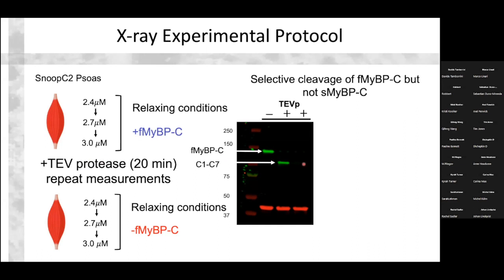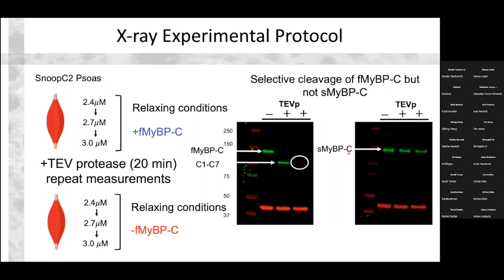And then this is a soluble piece of protein, because we can actually just rinse the muscle and the C1 through C7 fragment is removed. Conversely, if we do the same experiment with an antibody to slow skeletal muscle myosin binding protein C, what you see is that slow myosin binding protein C isn't affected by the TEV treatment in these mice. So they would be in the SPY-C1 ones, which is something that we're looking forward to working with.